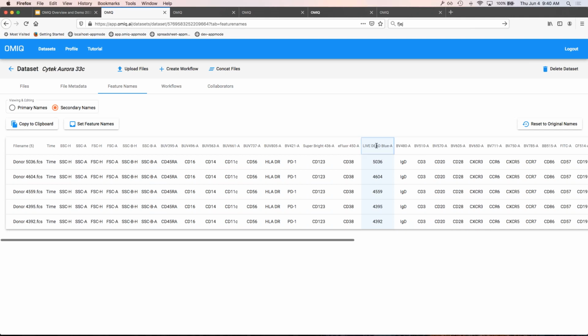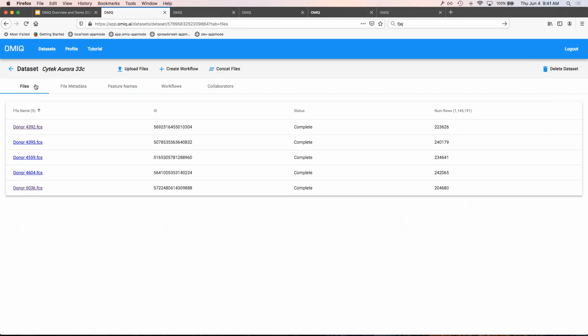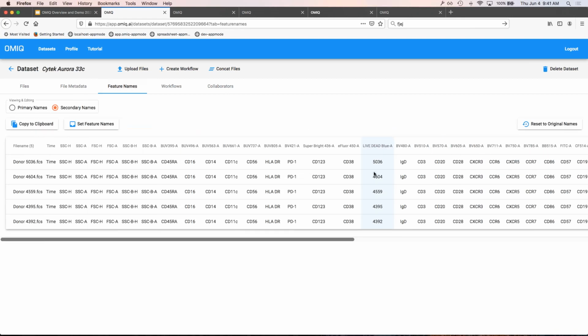It looks like the live dead channel was labeled with the sample, maybe the sample numbers, as opposed to being an actual name. And so I'm actually going to not correct this. I'm going to leave it here because it's useful for demonstration purposes, how even when you do have conflicts, OMIQ will try to work around them as best as possible.